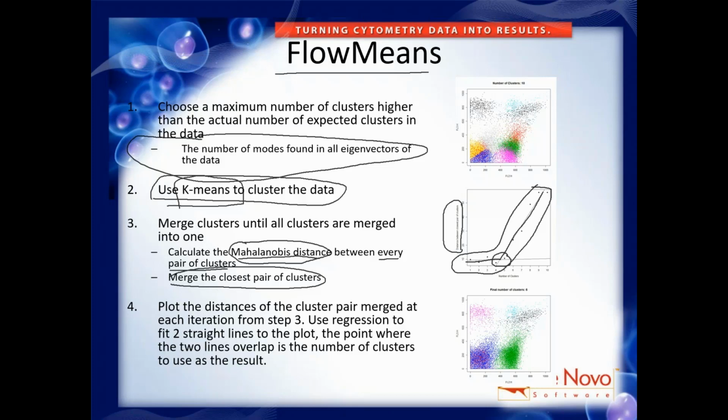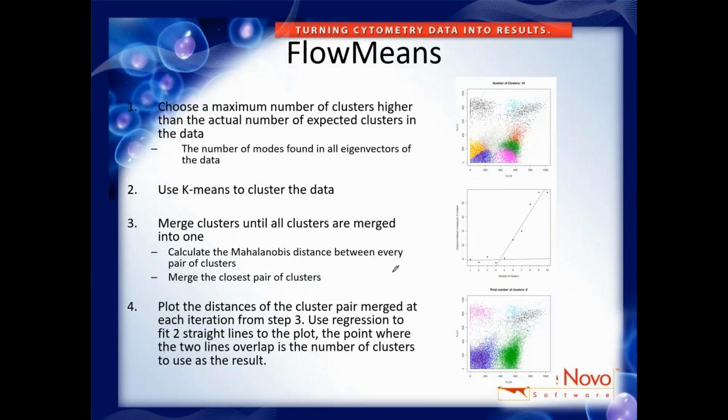You also notice that at the elbow itself, there are 2 points that look equally as close to that elbow. Which one do you pick? Is it 5 clusters or 4 clusters? I don't know. You know, that's a totally arbitrary decision. But then what you do is eventually you do get a final result that's here.